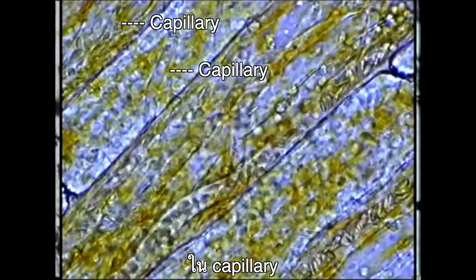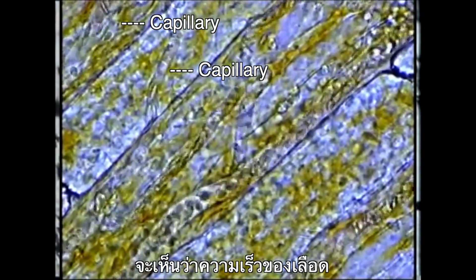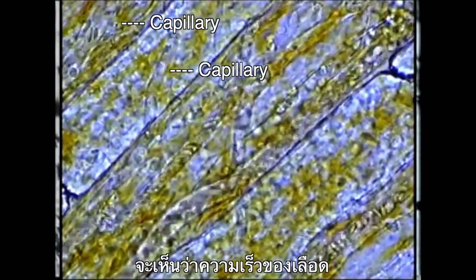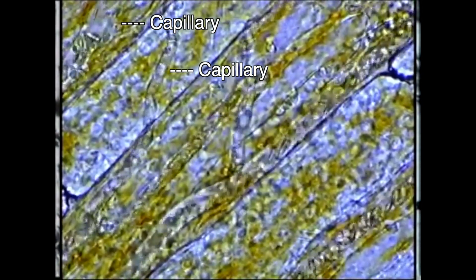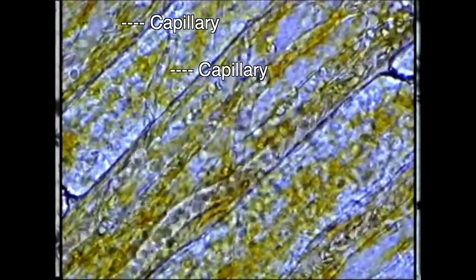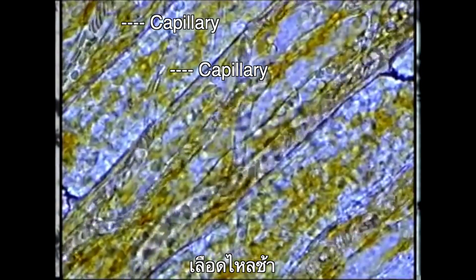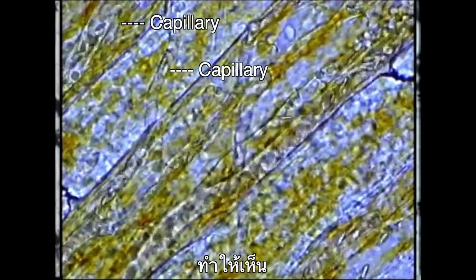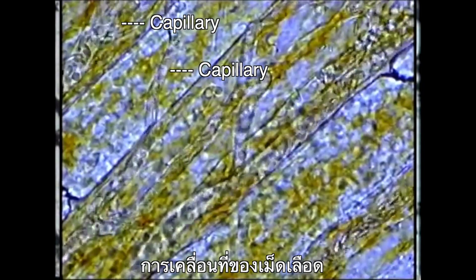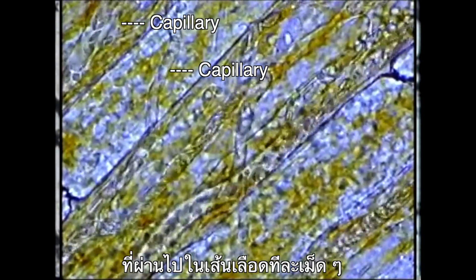Here is a capillary. The blood flow is slow and you should be able to see the movement of red blood cells squeezing through the capillary one by one.